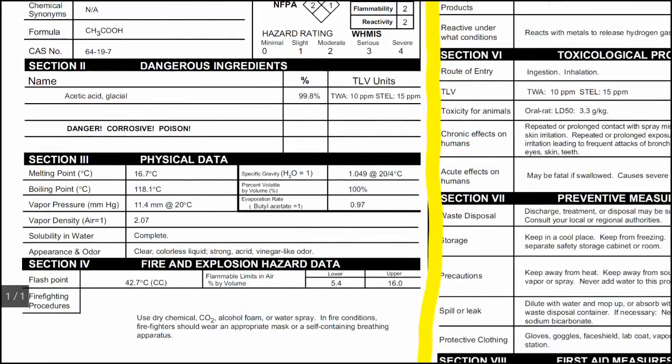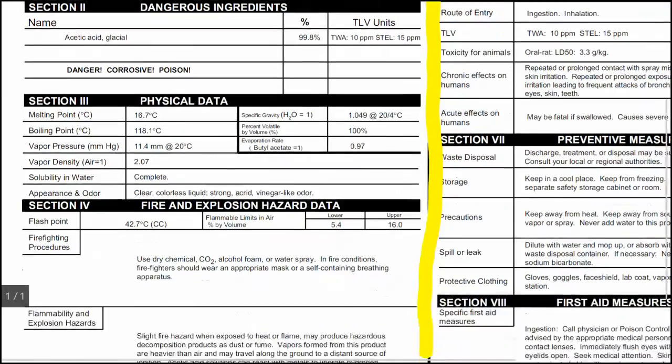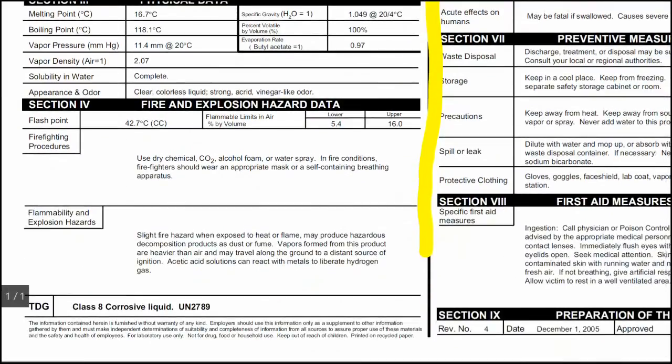Moving down to the Physical Data section, we can find things like the solubility or melting point of the substance. The fire and explosion data provide critical information for teachers and firefighters if they're called to deal with it. Please know fire safety rules and call your teacher.